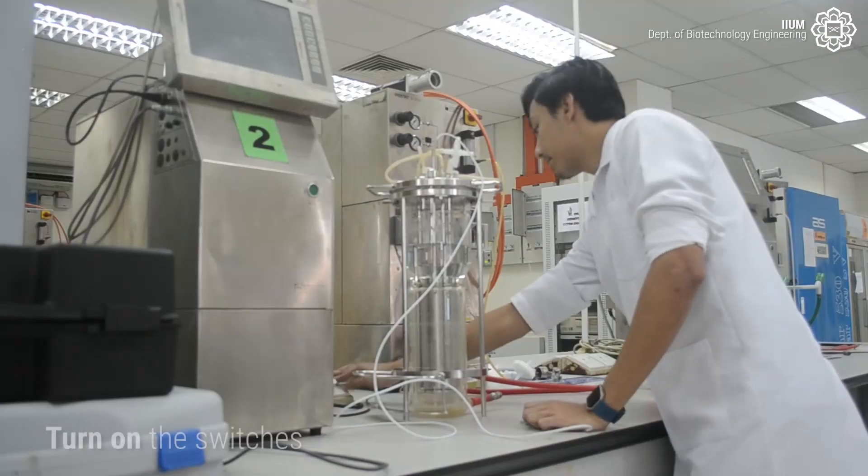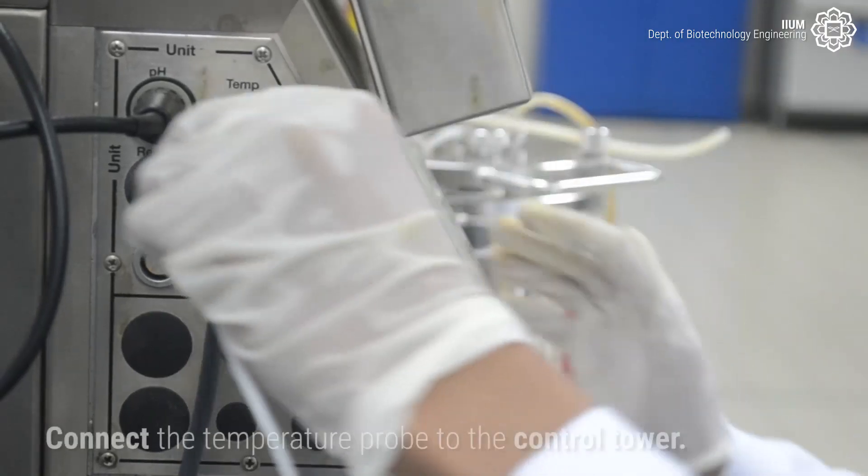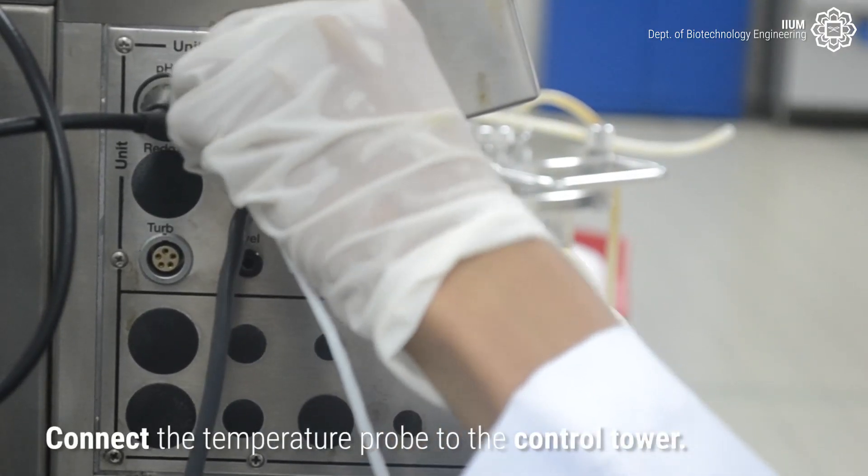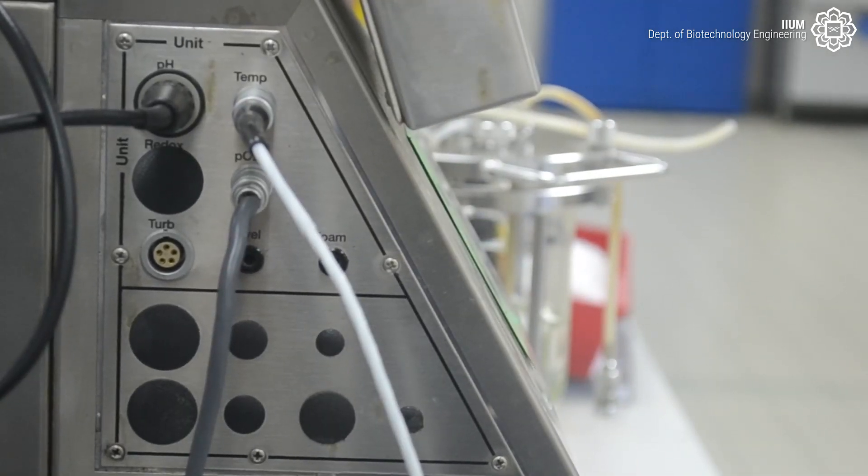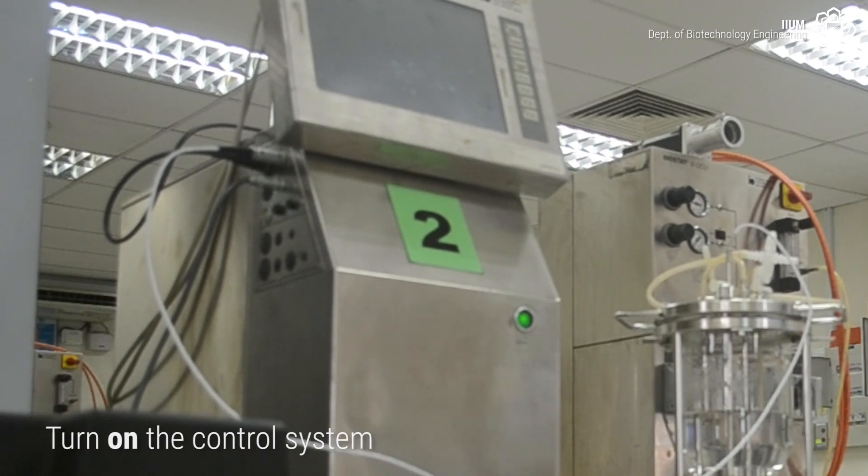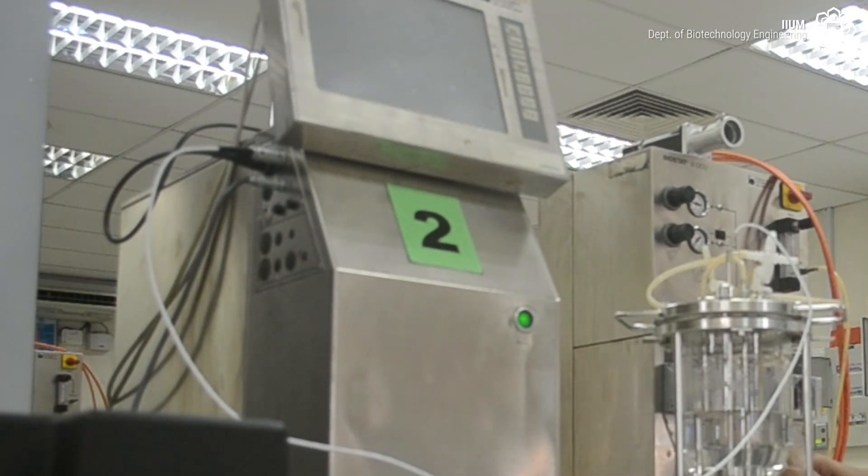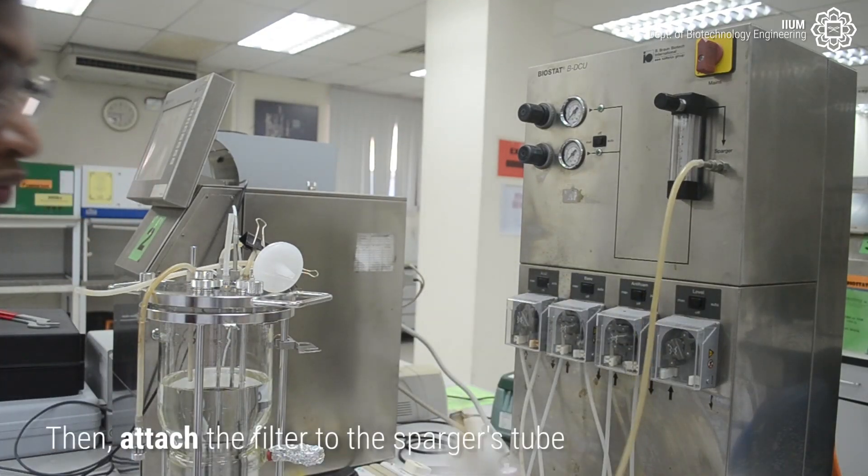First, turn on the switches. Connect the temperature probe to the control tower. Turn on the control system. Then attach the filter to the sparger's tube.